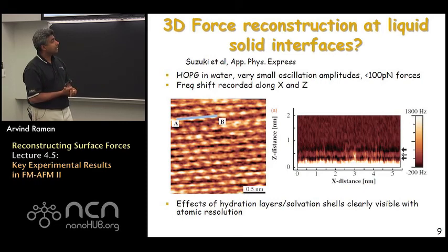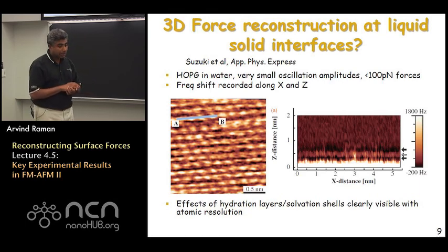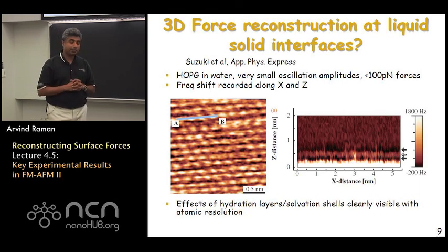What's remarkable here is that one sees a very high positive frequency shift as one approaches the interface, and that positive frequency shift is attributed to the presence of solvation shells or hydration layers of water molecules as they assemble at the water-HOPG interface. So clearly this notion of three-dimensional force reconstruction on surfaces with atomic resolution is a key area of research, and we certainly hope to see a lot of developments in this field in the near future. Thank you.